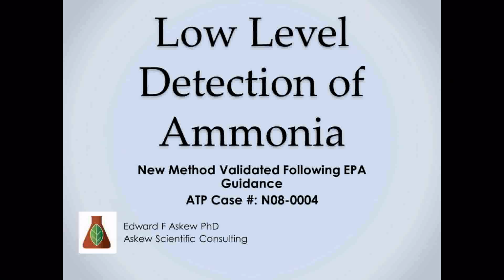Again, starting off, low-level detection of ammonia, new method validated following EPA guidance, ATP case number N08-0004. If for some reason you can't hear me, please just type down in the chat, "can't hear you."